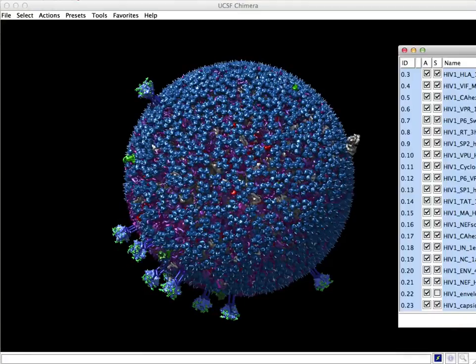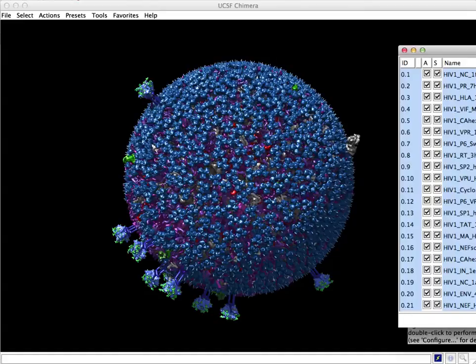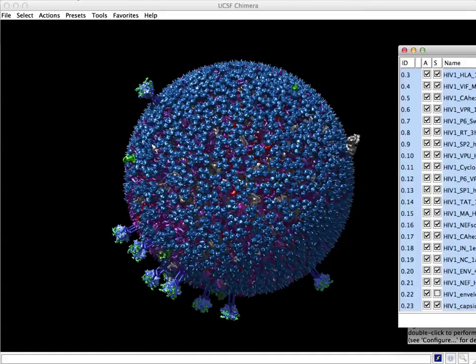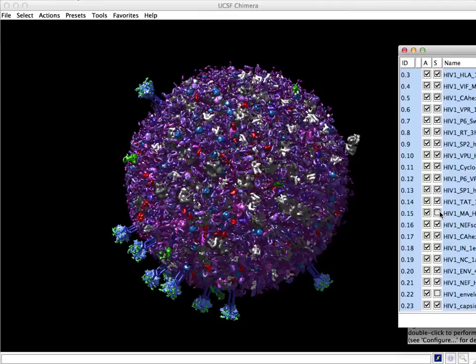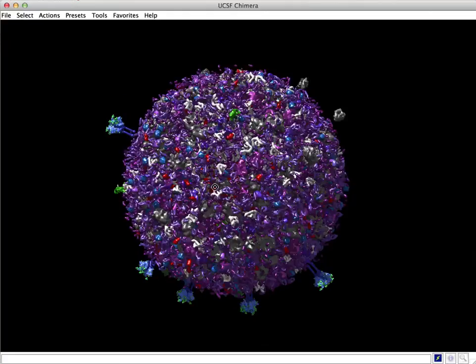And if we turn off these matrix proteins, that will substantially clear up and allow us to see the interior.